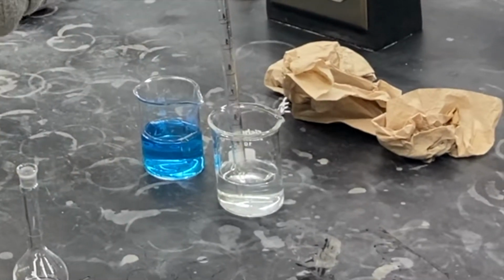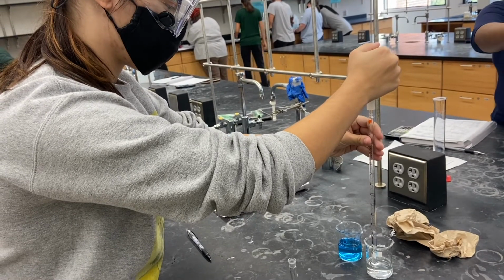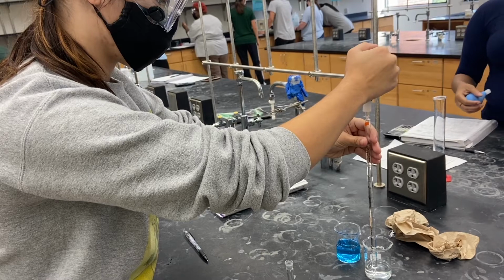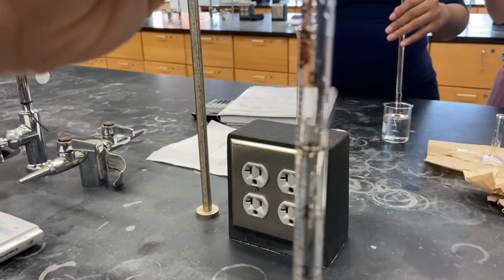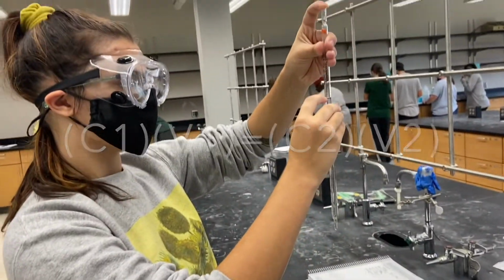This is a stock solution. It contains a known concentration of solute, in this case 20% sugar. We will be using this to make a dilution, which will have a lower concentration of sugar because it has been watered down. We will use the dilution equation C1V1 equals C2V2 to find the volume of the dilution.